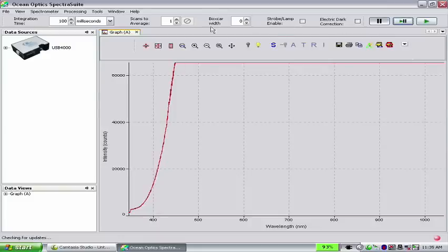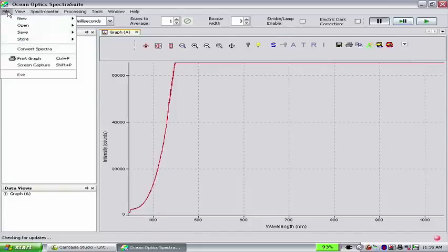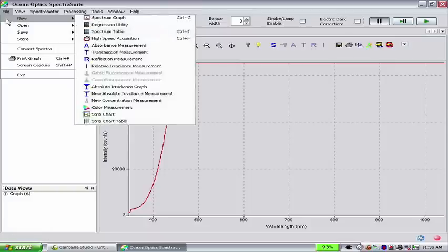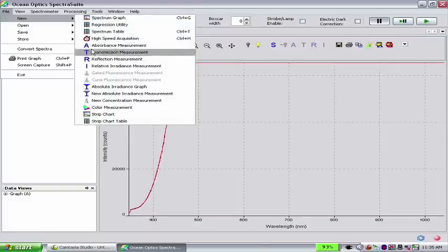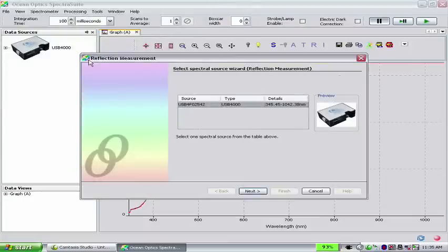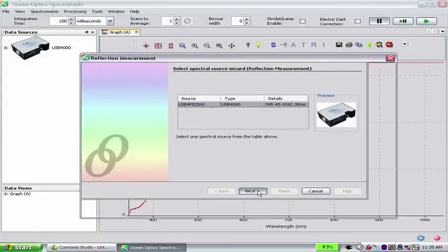To start the wizard, click on File, then New, then Reflection Measurement in the top menu. This launches the Reflection Measurement wizard. Make sure that your spectrometer is highlighted in blue as the source for spectral acquisitions. Then click Next.